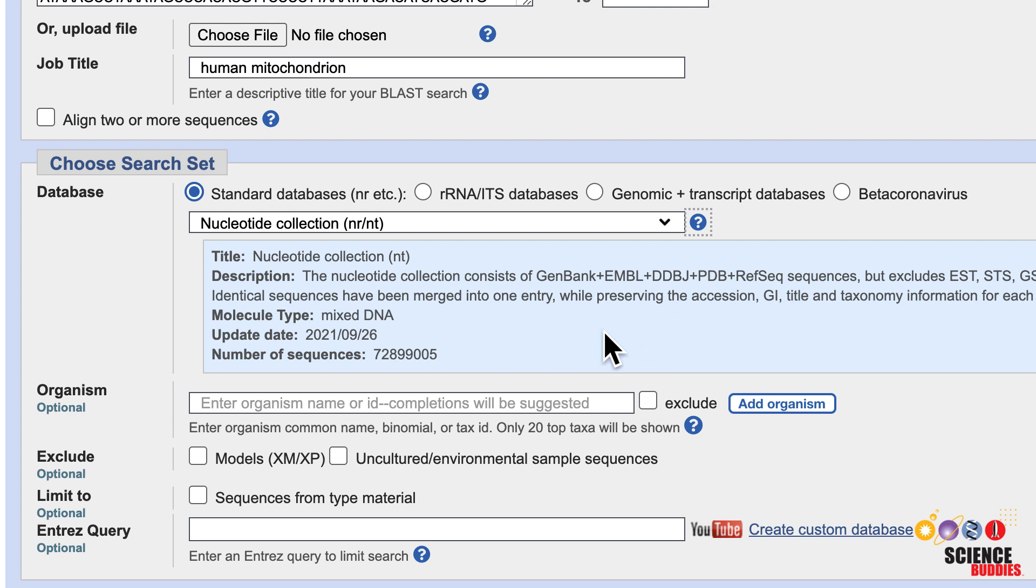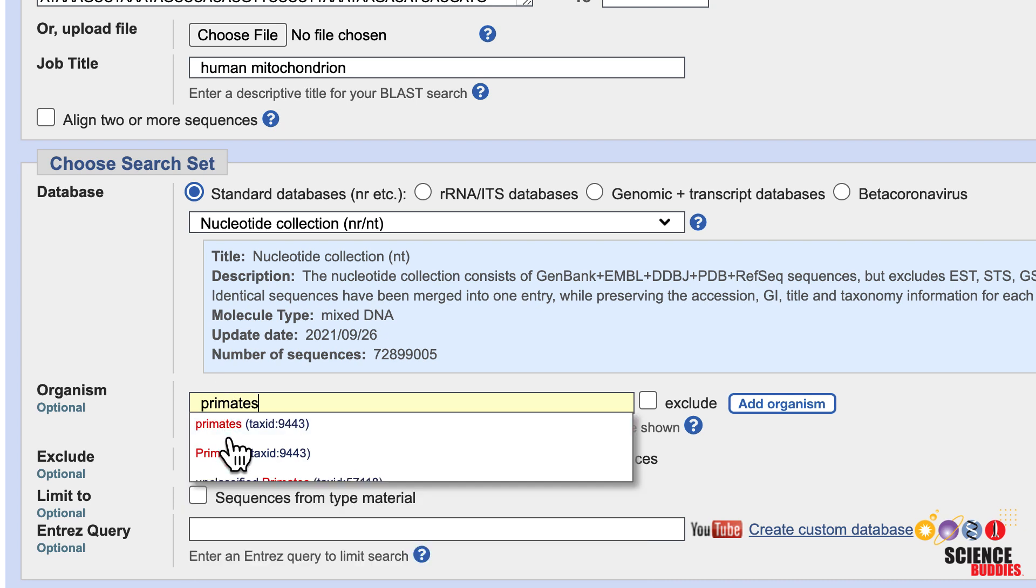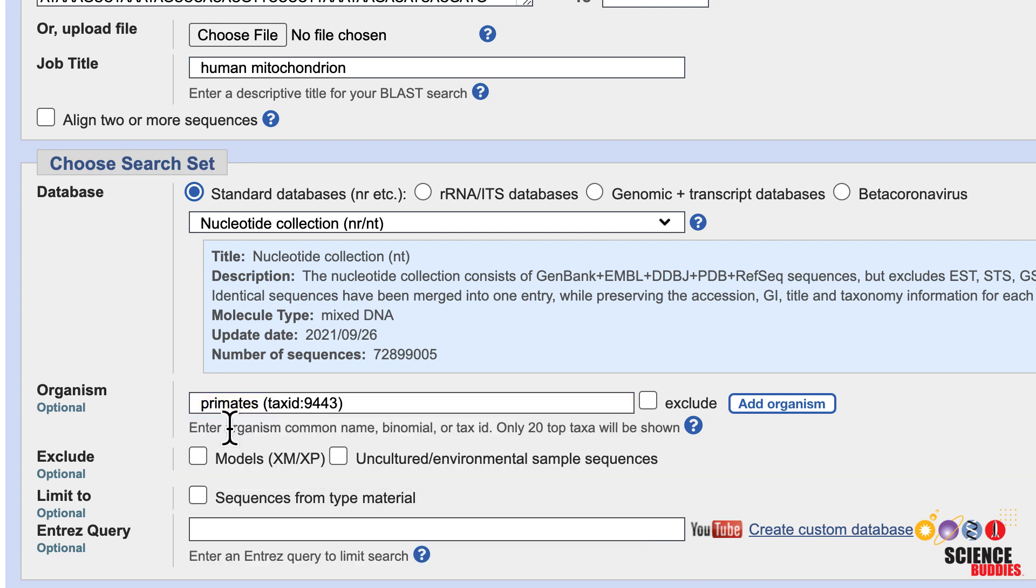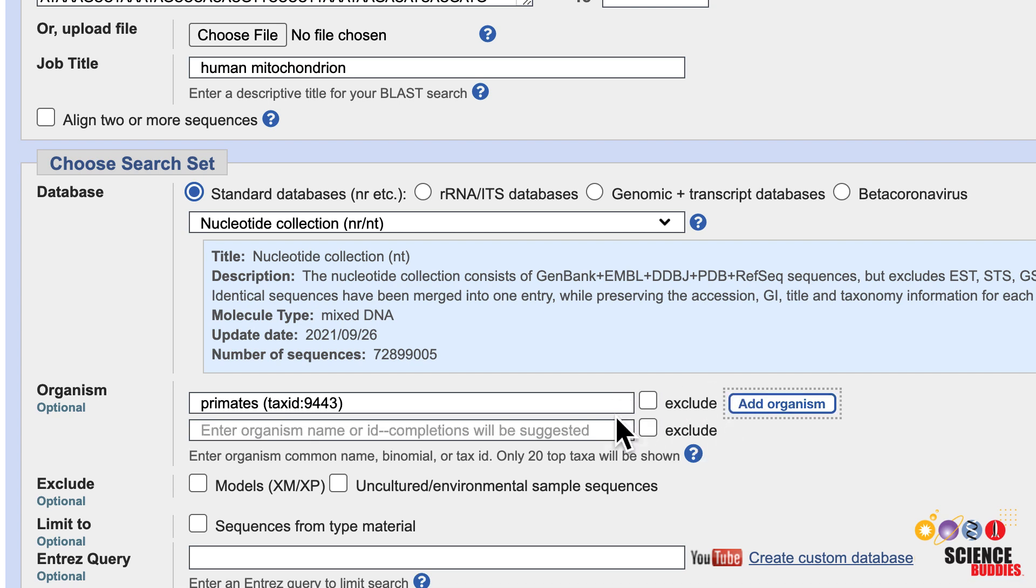To narrow down your search, you can limit your search to specific organisms by entering them into the organism box. Checking the exclude box excludes the selected organisms from your search. With the add organism button, you can add additional organisms.